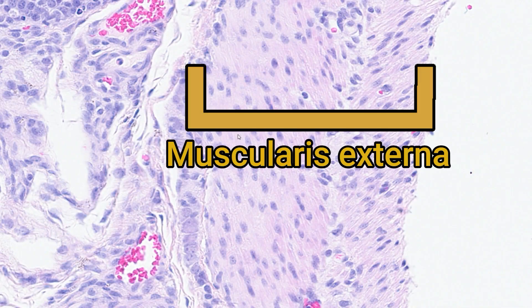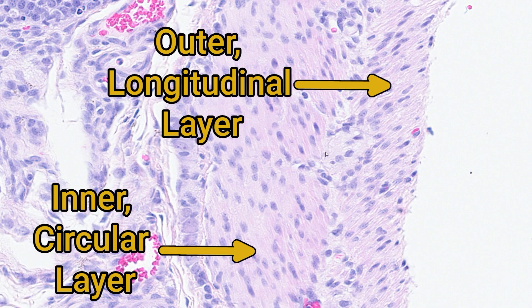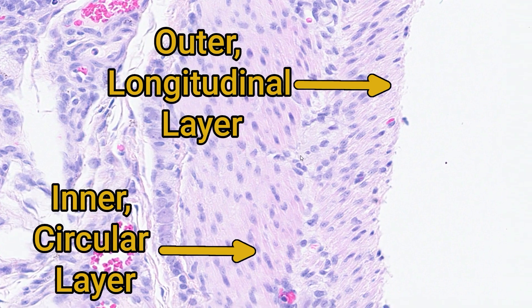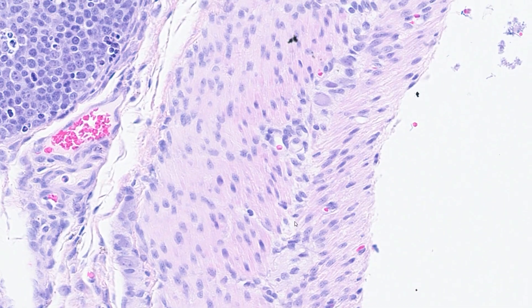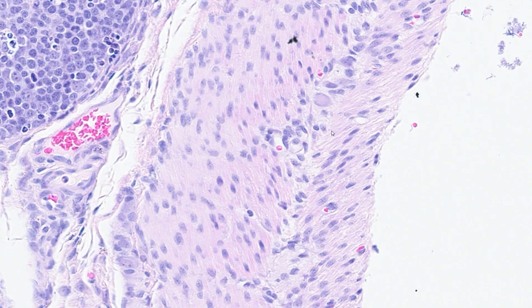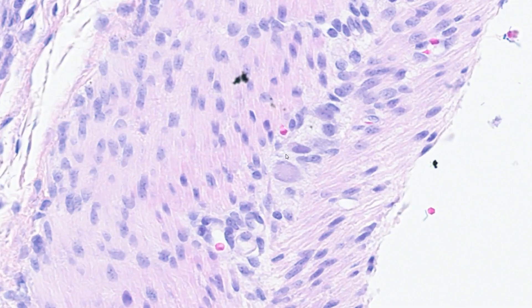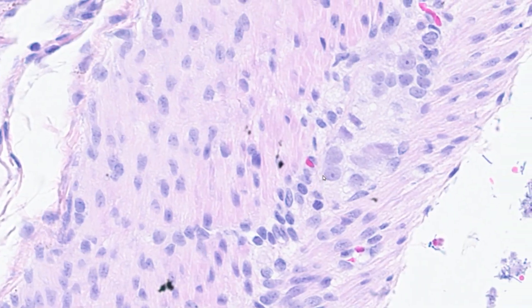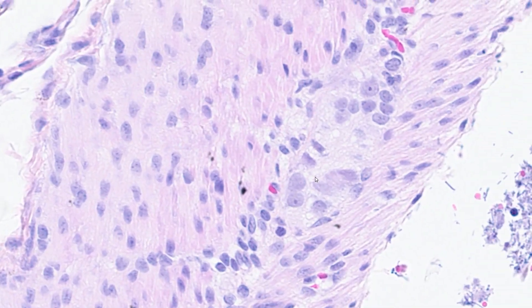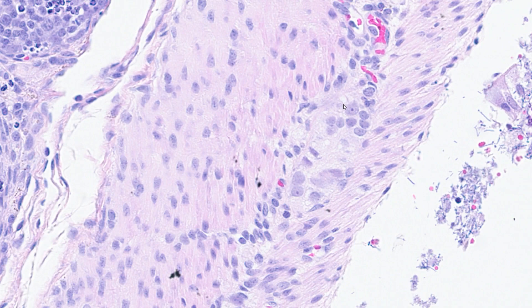Finally, there are the external muscular layers, which were covered thoroughly in the stomach histology video. One additional point: within the connective tissue between the two muscle layers, you'll often find ganglia and aggregates of neurons. These neurons are responsible for controlling peristalsis and are known as the myenteric plexus.